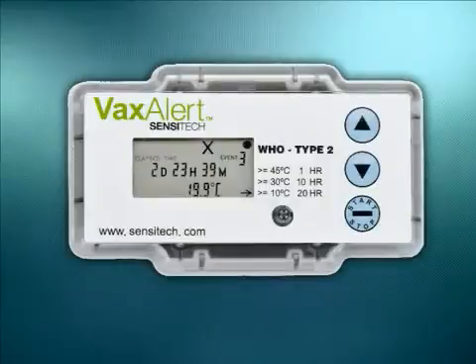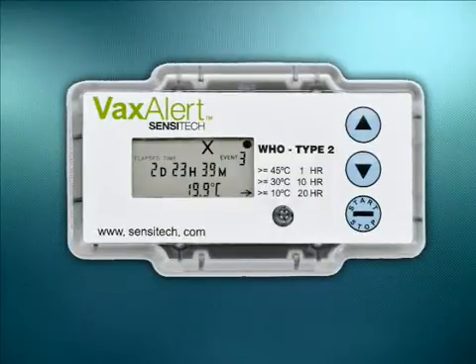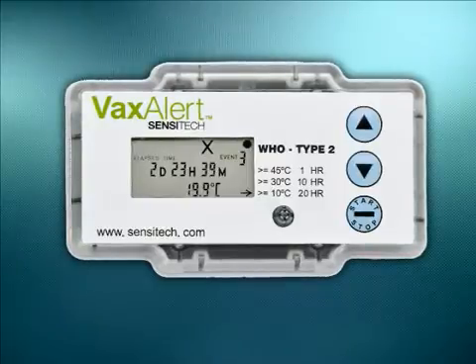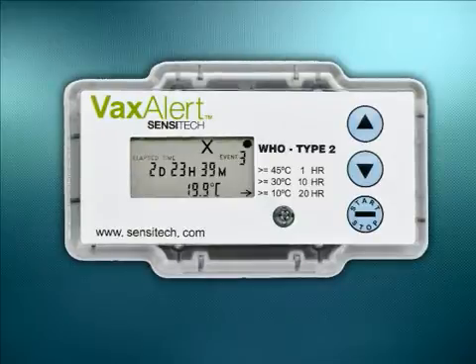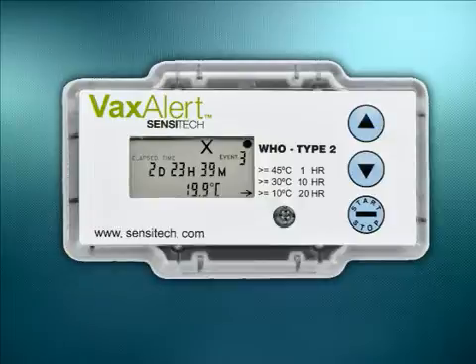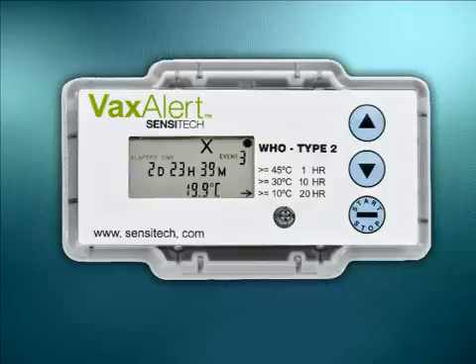If the Vaxalert experiences alarm violations, the device will record the violation time and the maximum or minimum temperature experienced during the alarm violation. Up to 3 distinct alarm violation histories will be stored within the device for each set time temperature alarm. This alarm information will be retained in the Vaxalert and can be viewed for a minimum of 6 months after stopping the device.